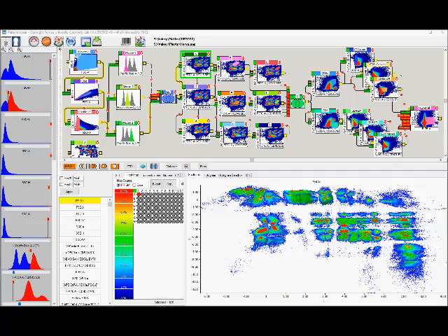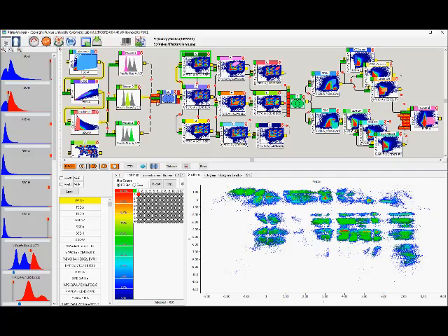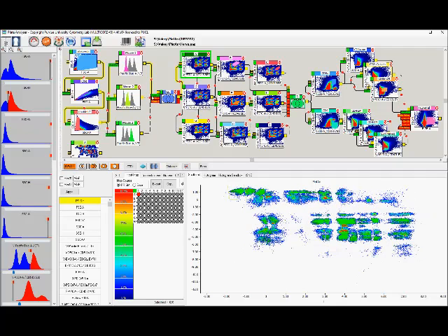Okay, so now if we want to select one mouse, we make this modal again. And now this map is now gateable. So if I look at mouse 1, mouse 2, mouse 3. Now if I select one of these gates with the left mouse, not the right mouse, left mouse, it shows me this population with mouse 3 or mouse 2 or mouse 1. But if I select this population, then it's purple. This population is yellow. This population, etc.